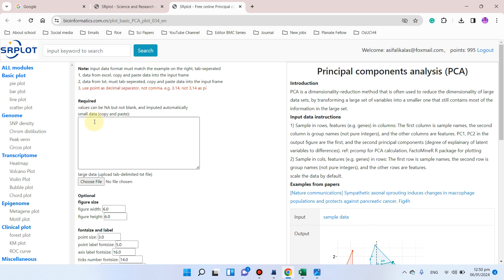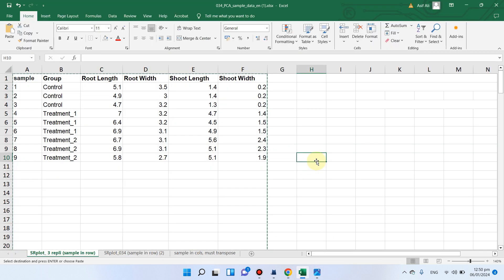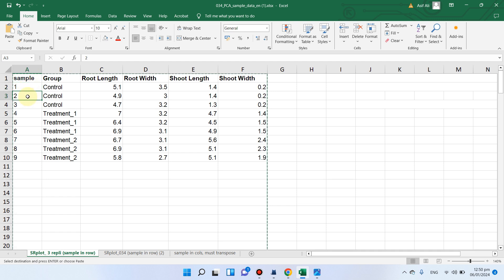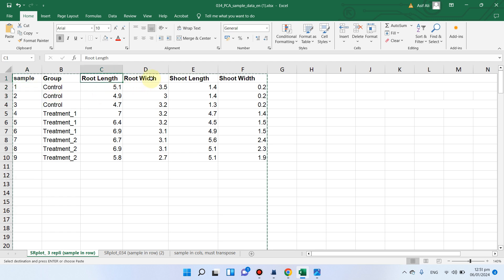Here you need to paste your data. Let me show you how to prepare your data to draw principal component analysis using your own data. Starting with the simplest example: the first column is the sample name, and each sample has three replicates. The first sample is the control, and we also have data for root length, root width, shoot length, and shoot width.